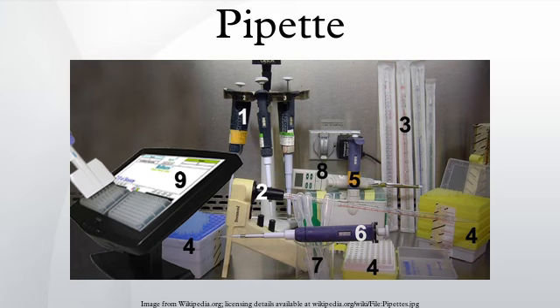A pipette, pipet, pipettor or chemical dropper is a laboratory tool commonly used in chemistry, biology and medicine to transport a measured volume of liquid, often as a media dispenser. Pipettes come in several designs for various purposes with differing levels of accuracy and precision, from single-piece glass pipettes to more complex adjustable or electronic pipettes.